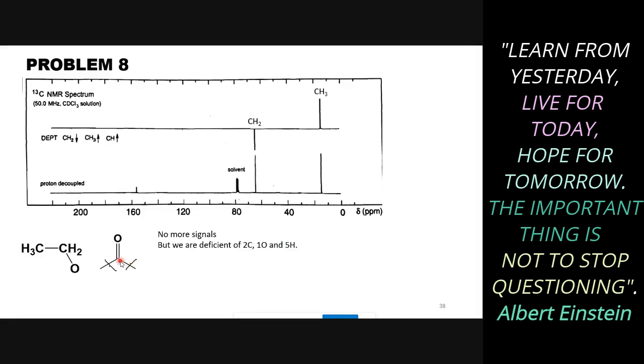Here we have three carbons, two oxygens and five hydrogens. And we're deficient of two carbons, one oxygen and five hydrogens. So what do you suggest? What are we missing? We don't have any other signal in the spectrum. So what we are missing here?